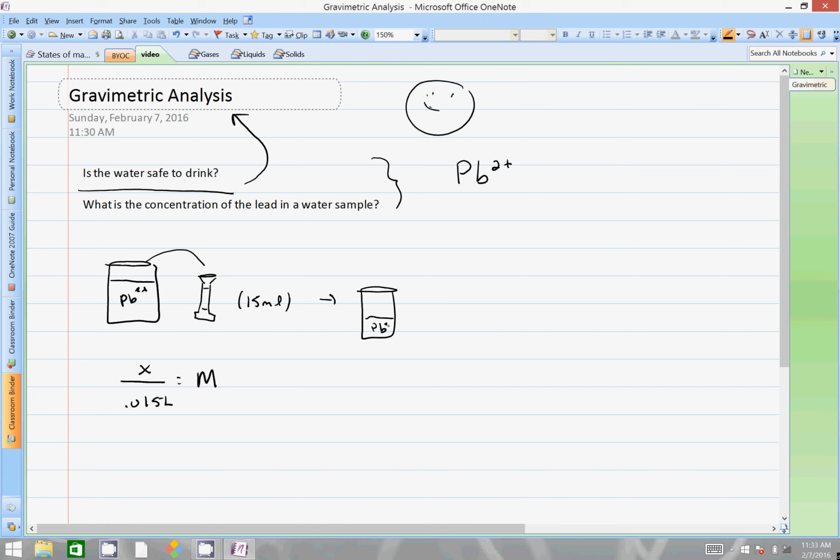At that point, we will then take some sodium chloride. Now you'll find a beaker of sodium chloride on your desk, and you might see some solid on the bottom. It's quite concentrated, so it has maximum solubility at this point. You'll see a pipette in there, and all we're going to do is simply pipette into this several pipettes.